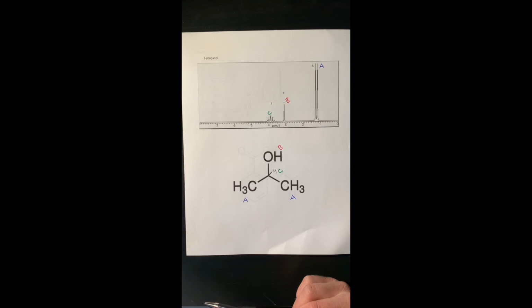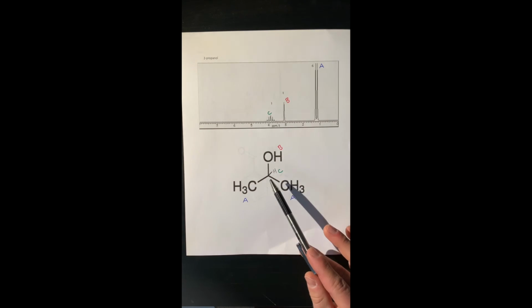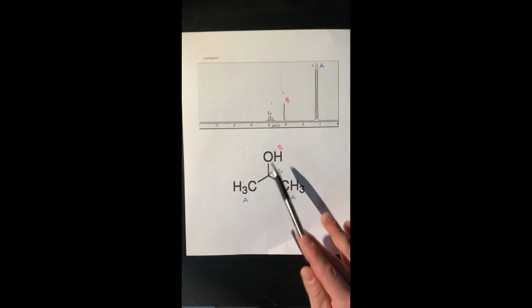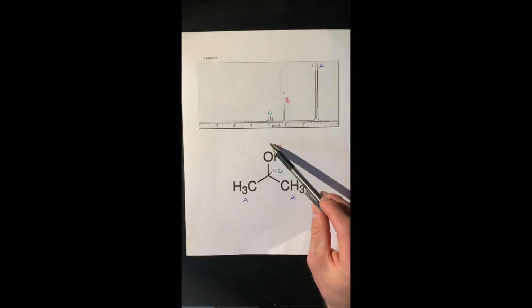So this is typically where a chemical shift should occur for a typical alkane, just above 1, and that's because it's further away from the alcohol. So the next furthest downfield peak is right here, the singlet at about just above 3 ppm.